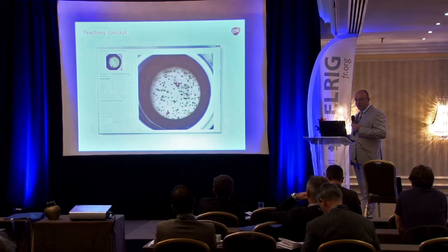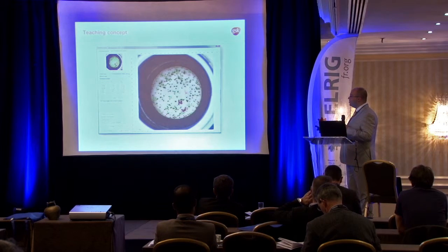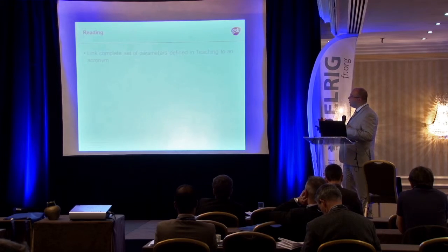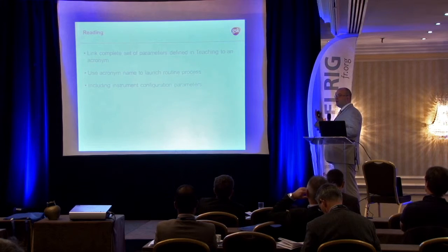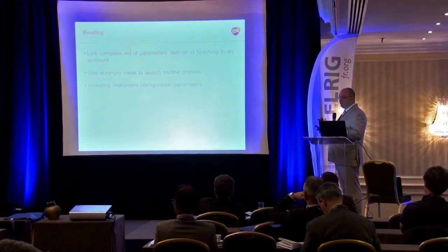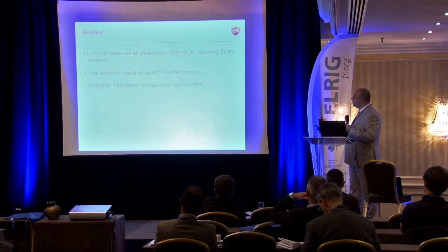That's for the teaching. But you tell me, okay, now I have all my parameters, but what will I do with them? I have to include them now in the routine process. So I have to go now to the reading. I will use the acronym, as I said before, and as technical parameters behind the acronym, I will link my set of parameters for the image analysis also. And in the reading, I also include the instrument configuration, and in this way I have all my parameters to be able to launch a reading of, let's say, 100 or 200 plates, if you want.